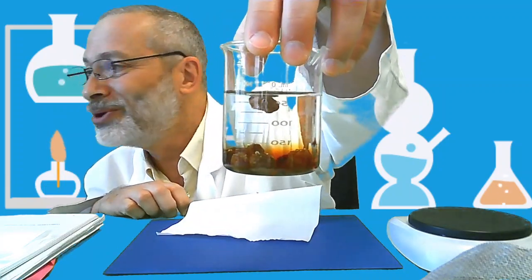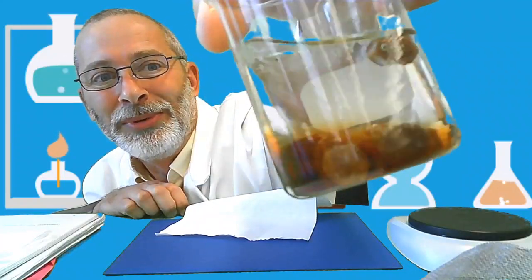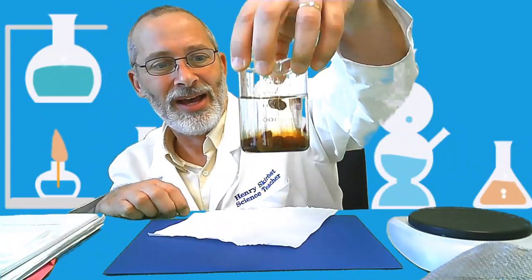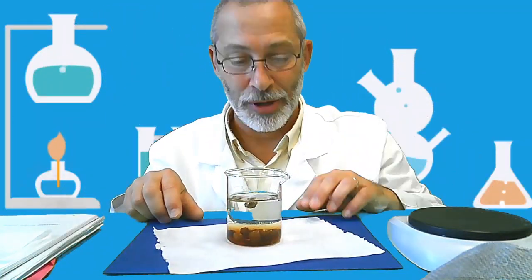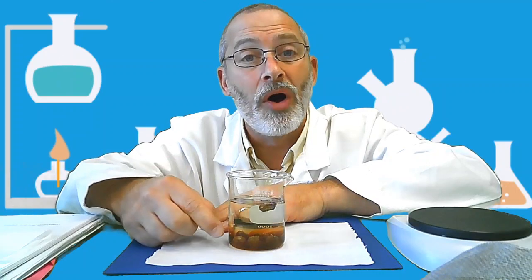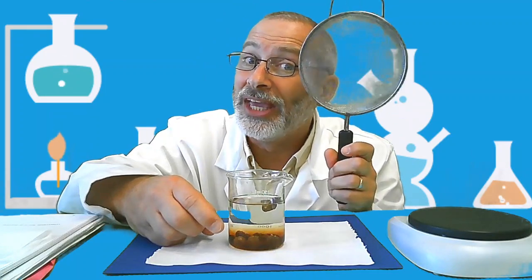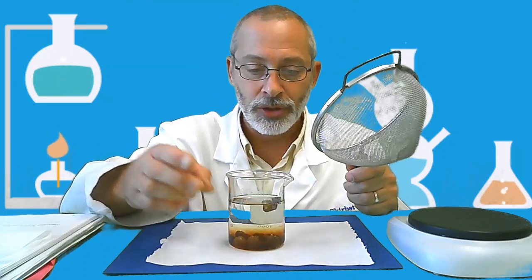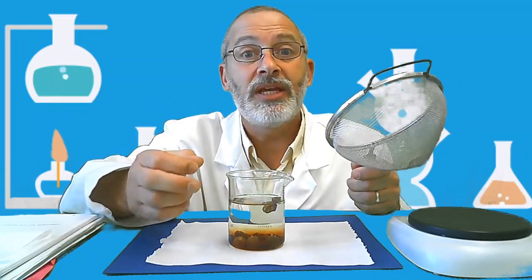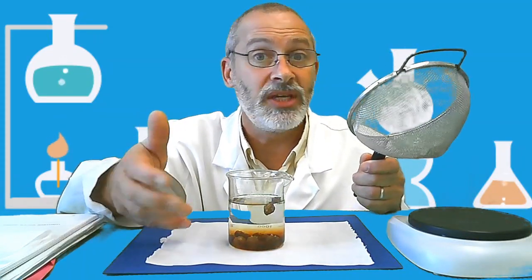And as I hold this closer to you, you can probably see the water on the bottom is turned a little bit brown. And notice what has happened to the raisins. They look a little bit plumper. Now, what I'm going to do right now is drain the water out of the beaker using a semi-permeable device called a strainer. And I'm going to separate the raisins from the water so that we can determine the mass of just the raisins without the water on our digital balance, and we'll see what happens.